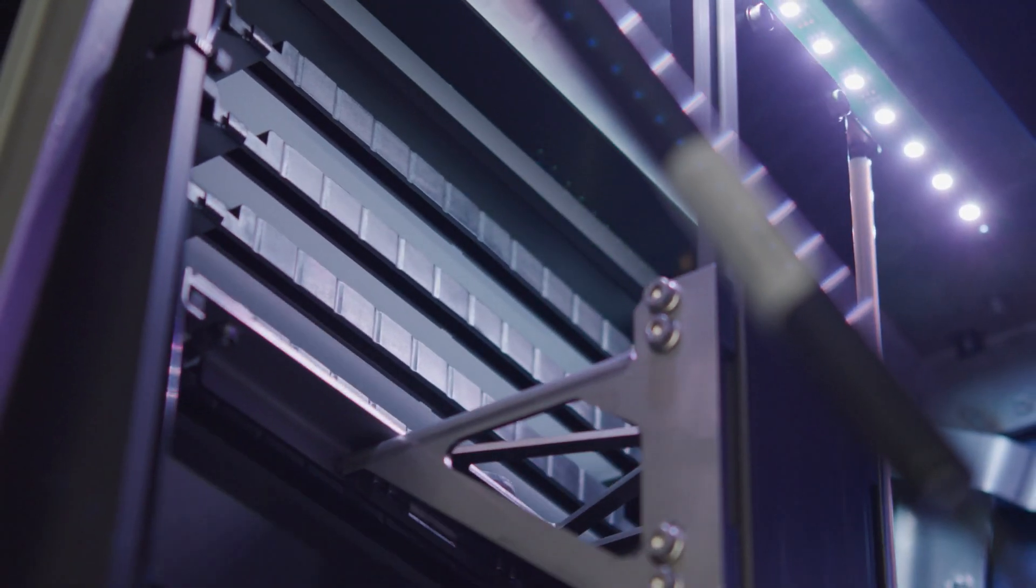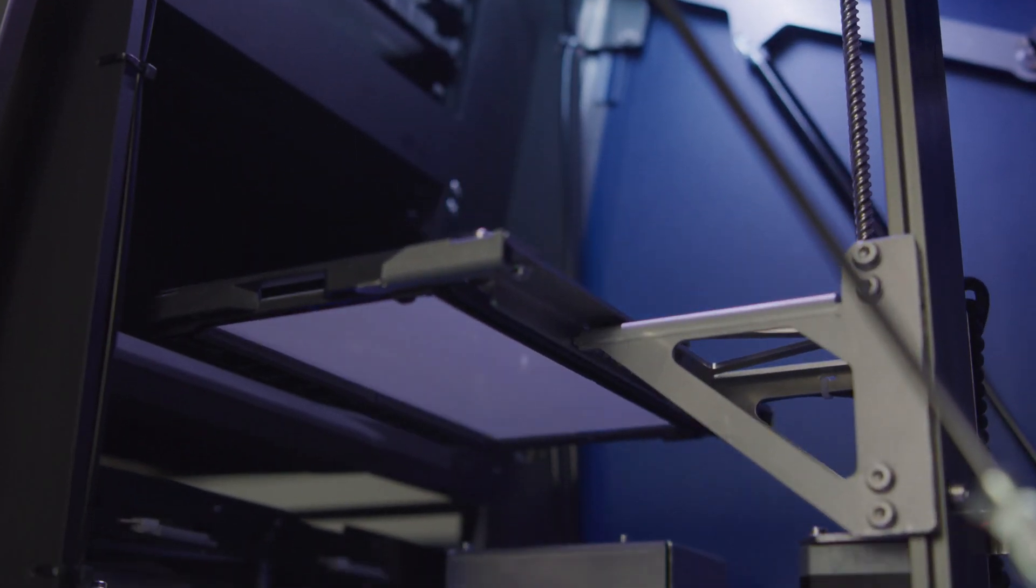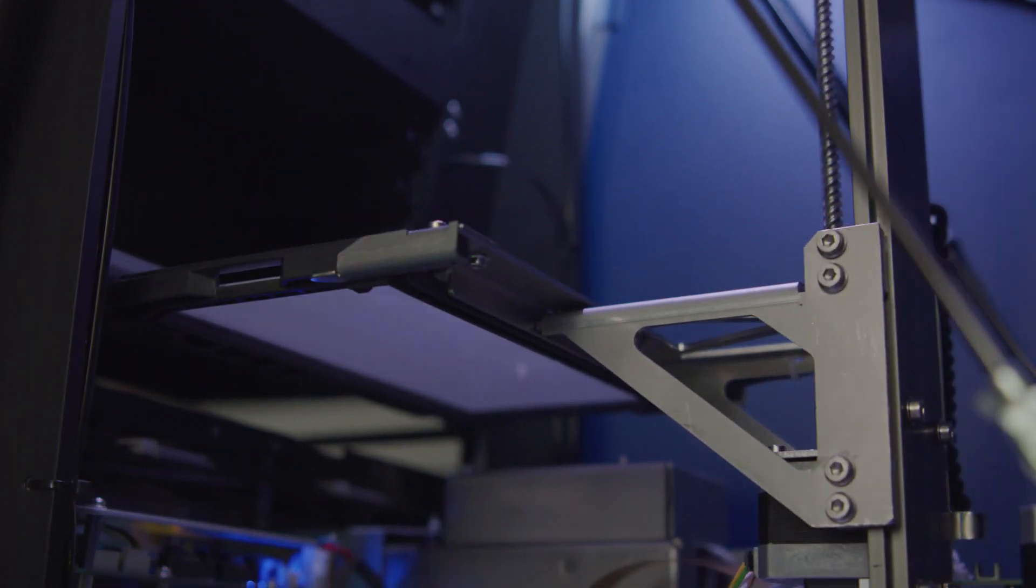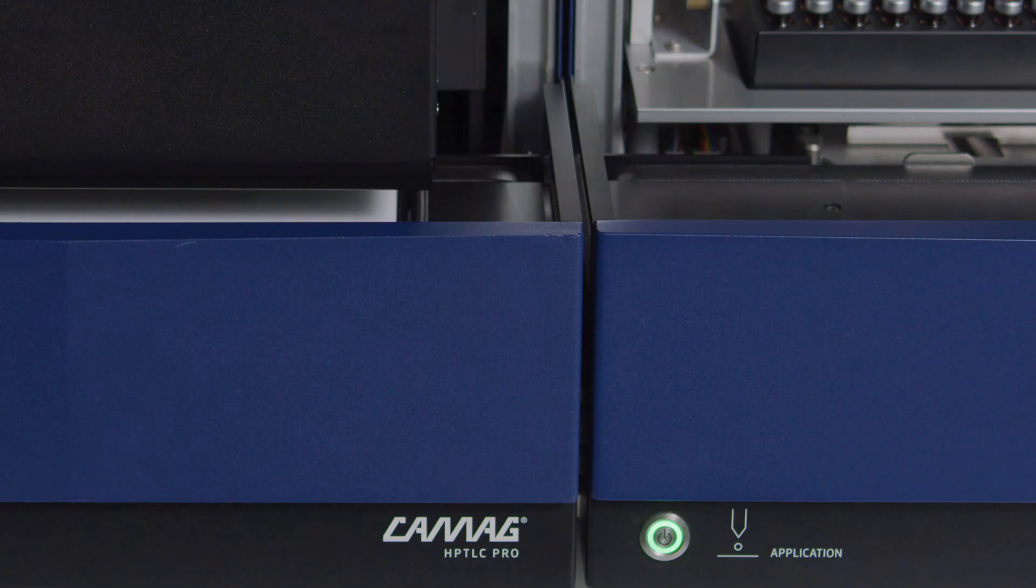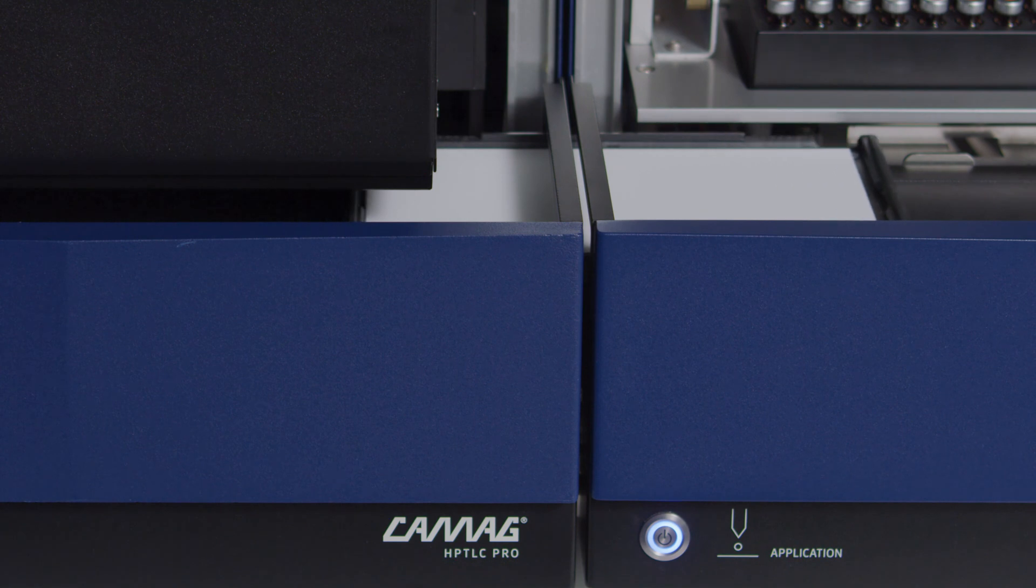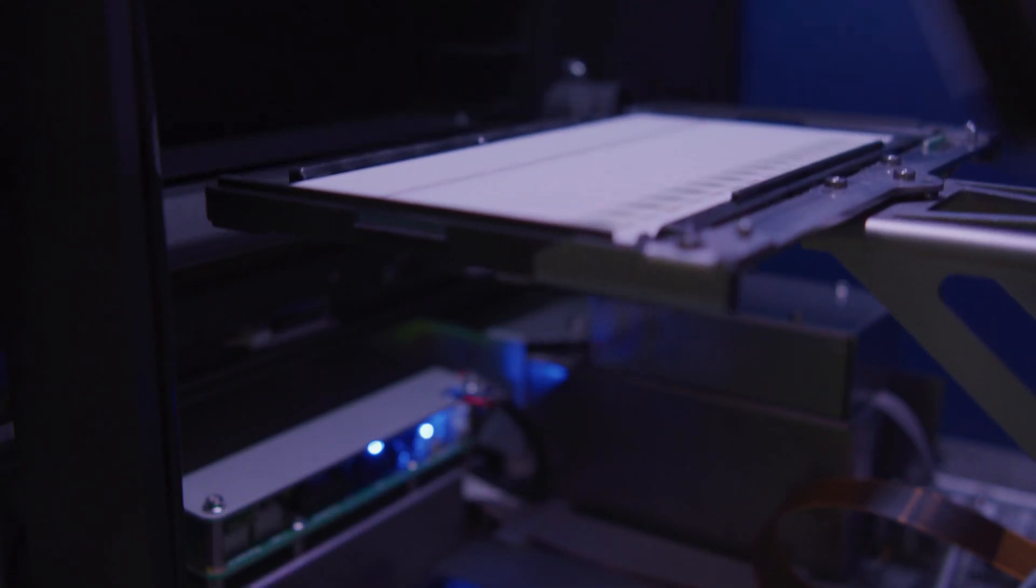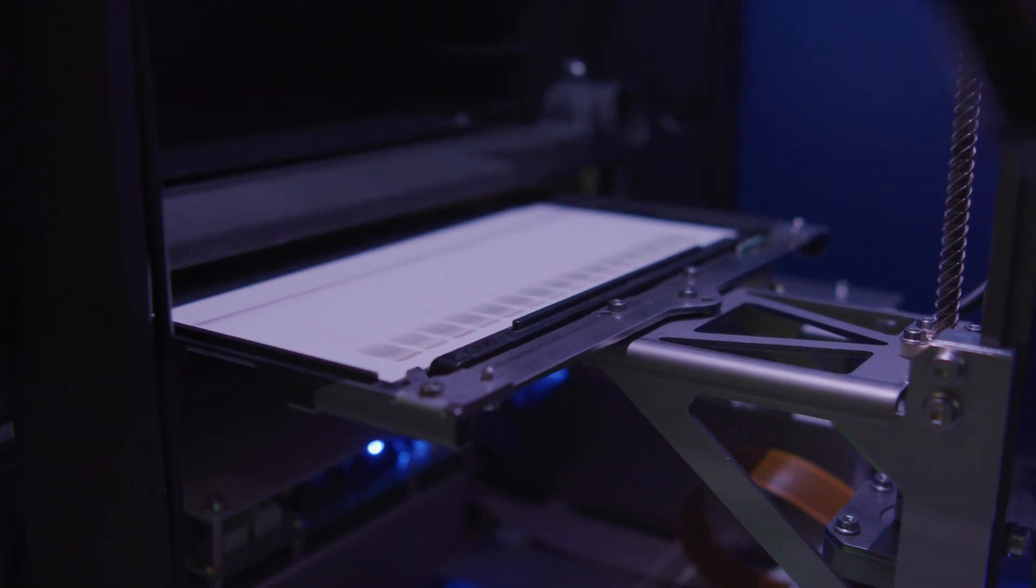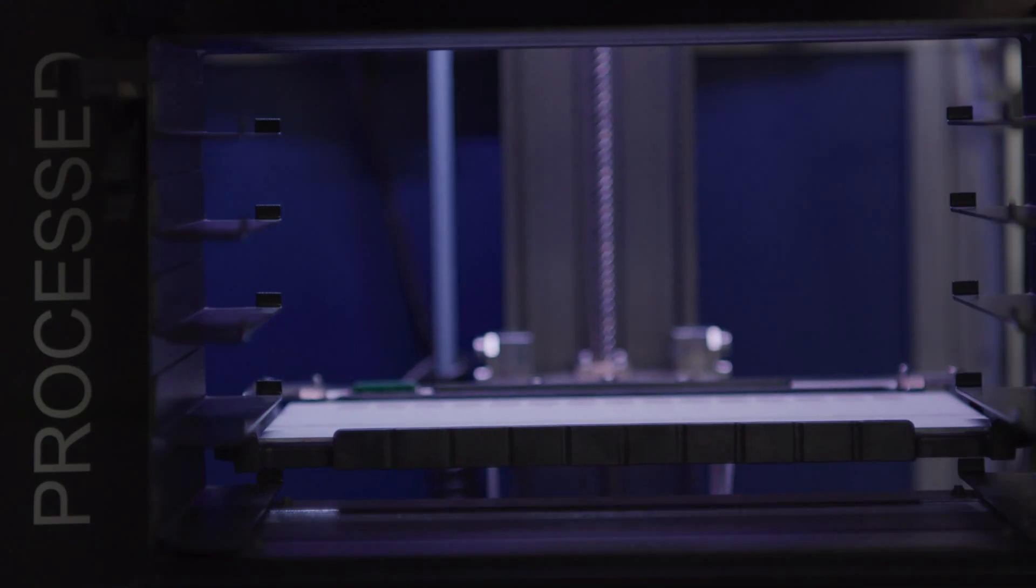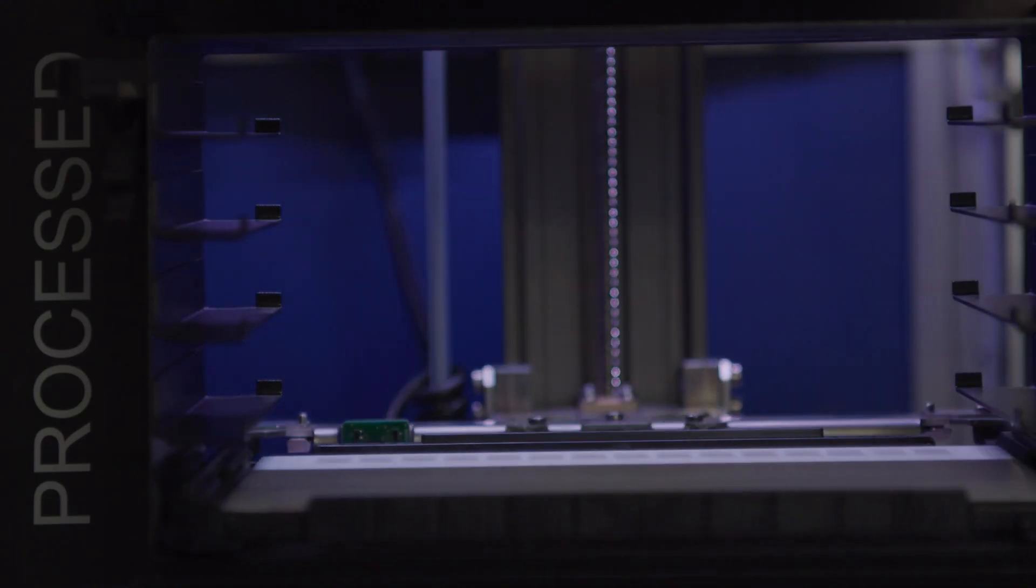Responsible for plate handling, the module plate storage feeds the system with clean plates, which are transported to the subsequent modules: application, development, and derivatization. After chromatographic processing, the plates are transported back to the module plate storage.